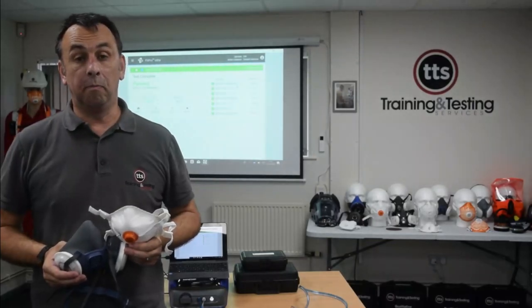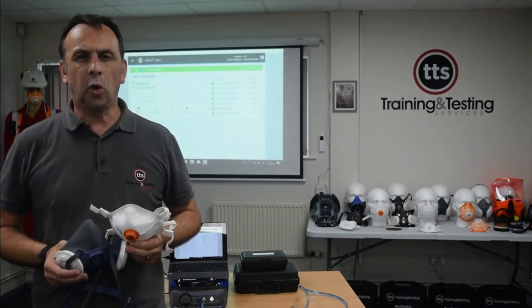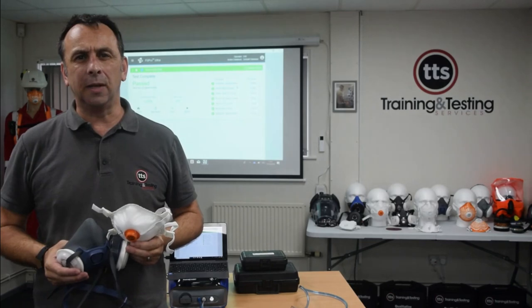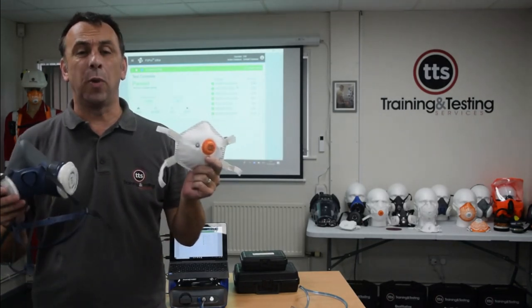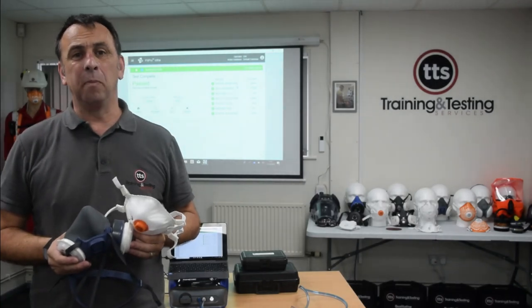Okay guys, so that's both sets of fit tests completed. I've now had a shave, so everyone's a winner. Let's just talk about what we actually saw there. As you could see, both of these masks actually passed even when I had 7 days worth of growth. Now, I sort of guessed that was going to happen before I did the test.